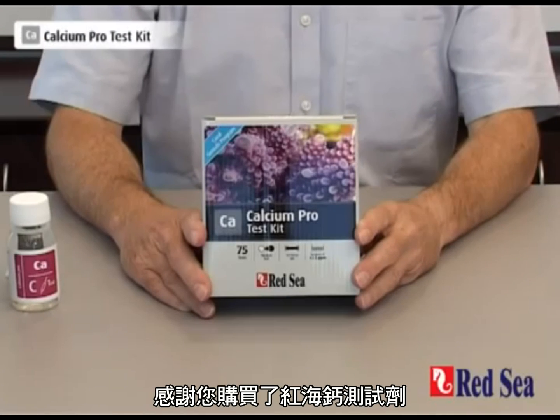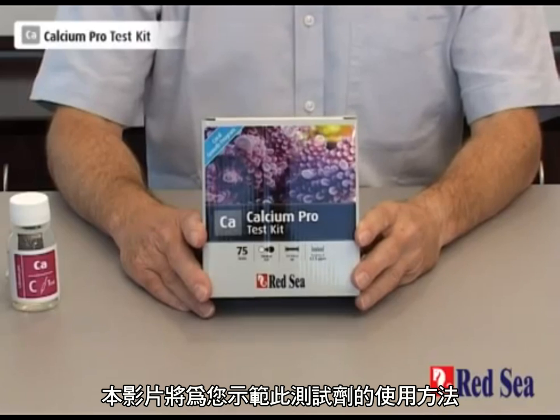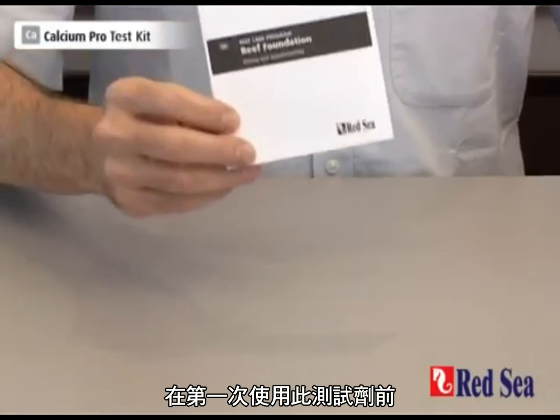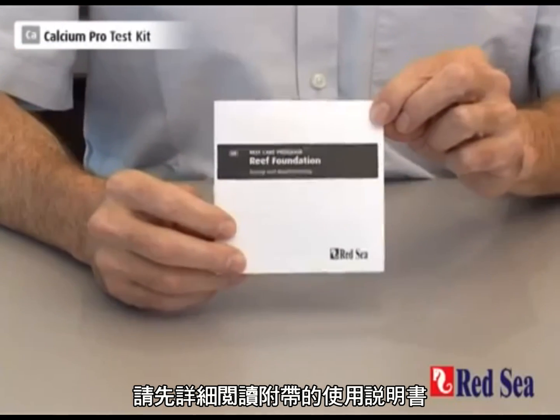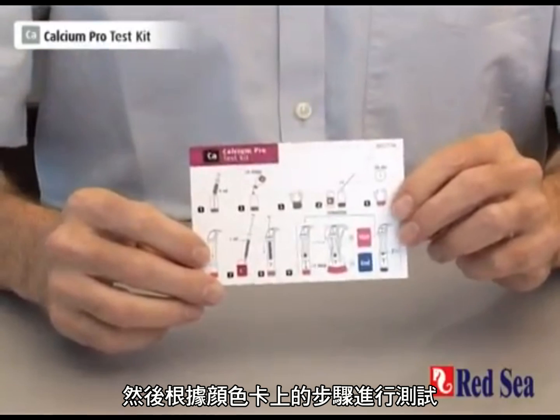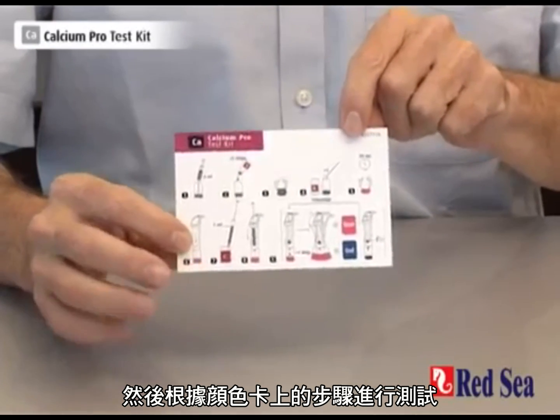Thank you for purchasing Red Sea's calcium test kit. The purpose of this video is to demonstrate how the test is meant to be performed. Before performing the test for the first time, make sure you read the instructions included in the manual. Once you've read the written instructions, you have very easy to follow graphic instructions on the color card.